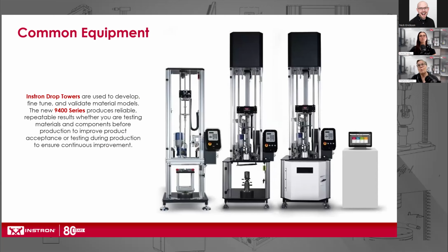So all drop towers are essentially the same. They have the same components we talked about. You can have a very simple system, such as the one to the left, which is a gravity system. Once the falling mass is released from the drop height, it's purely a gravity release, a gravity increase in speed.